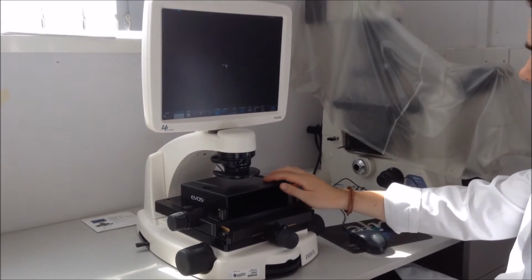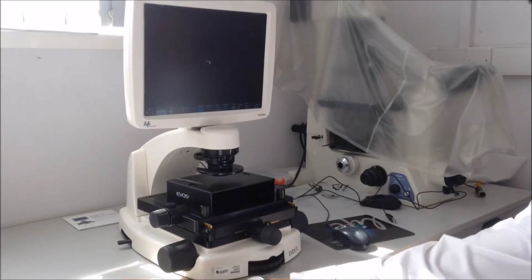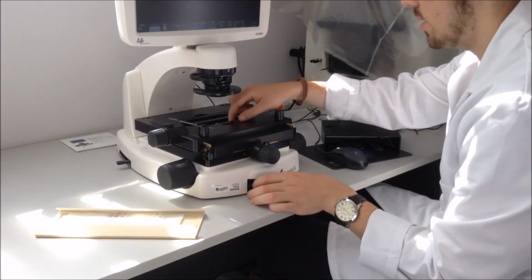This is called a dark box, which is used to block out any light which could interfere with any fluorescence which is being emitted from your sample. When inserting the slide, you remove the dark box, and as you can see here, the lenses are located.